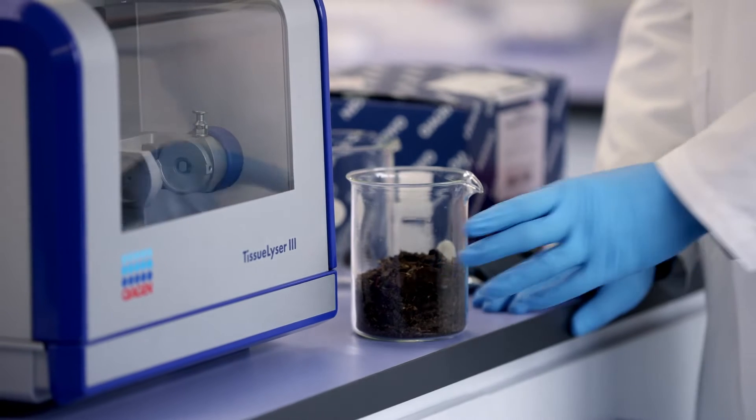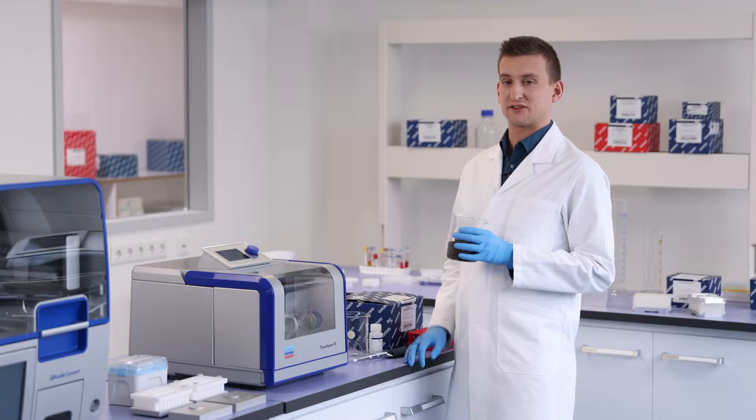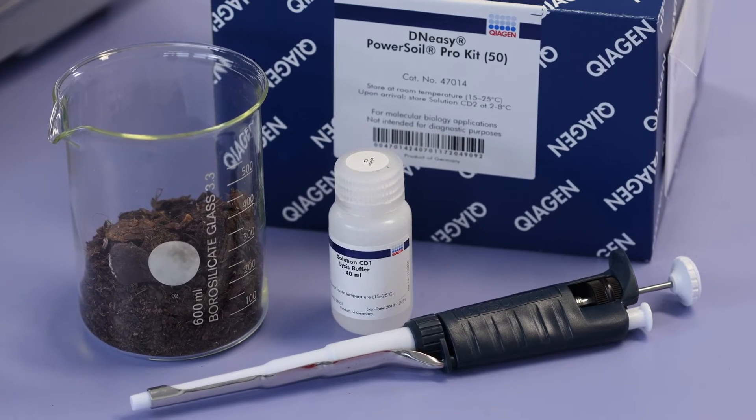Today we will homogenize soil samples with the Tissalizer 3. They can be used later for DNA extraction with the DN-Easy PowerSoil Pro Kit.